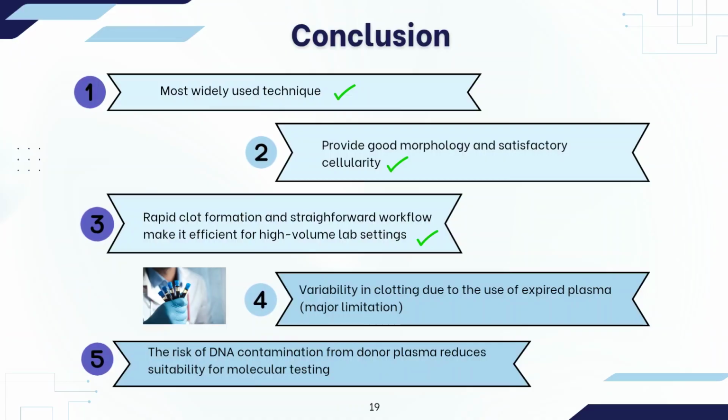However, there are important limitations, such as using expired plasma can lead to inconsistent clot formation, uneven cell distribution, and fragile pellets. Finally, expired plasma may contain amplifiable DNA, which increases the risk of contamination and may affect the accuracy of molecular testing.